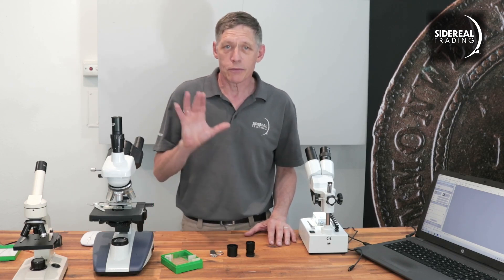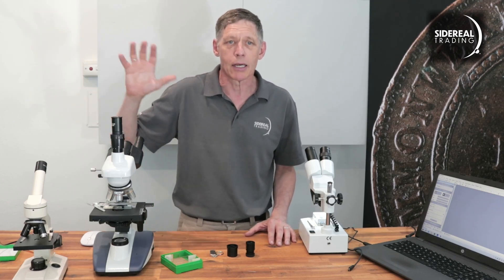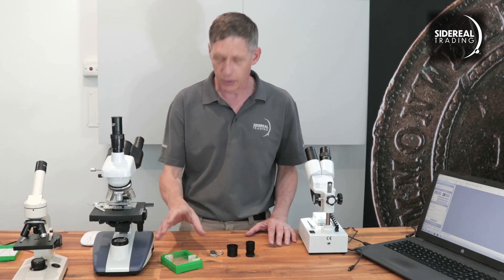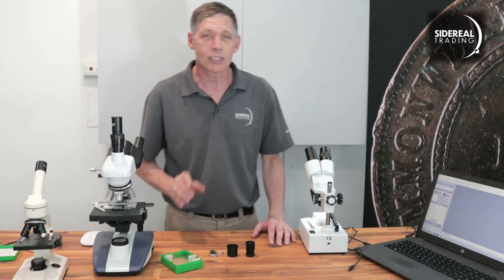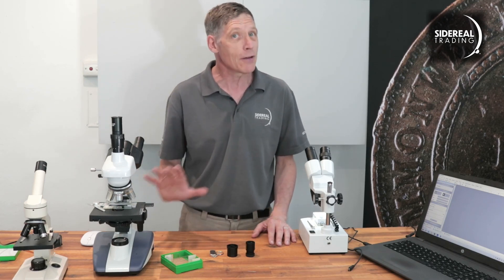We've got a few types of microscopes here. There's two biological types where the subject is on a slide — we've got some slides. We've also got a stereo microscope, and our subject here is Diego's favourite bug, the Euphilis Weevil.